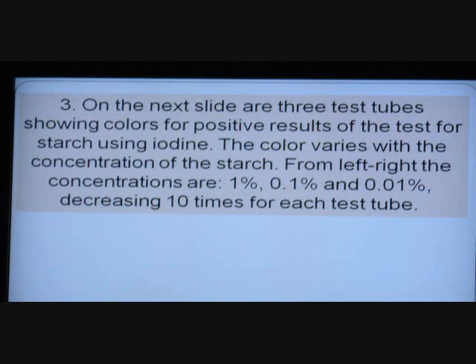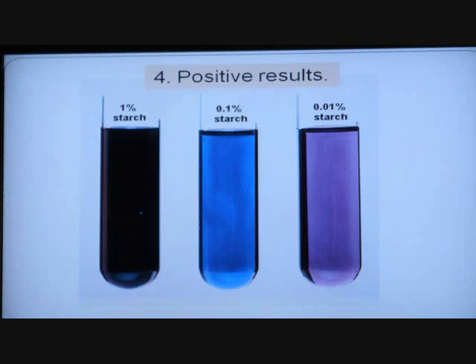Remember now, the strongest starch is on the left. And on my picture, the weakest starch is on the right. So there they are. And you can clearly see. As a matter of fact, that one on the right would make you think about protein stain, if you didn't know better. Because remember Biuret? You stain proteins that color. So you got to know what stain you're talking about when you discuss these colors.